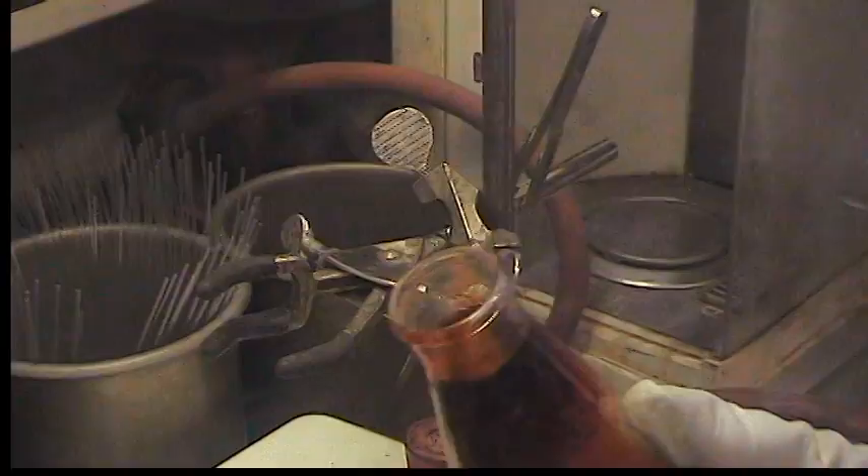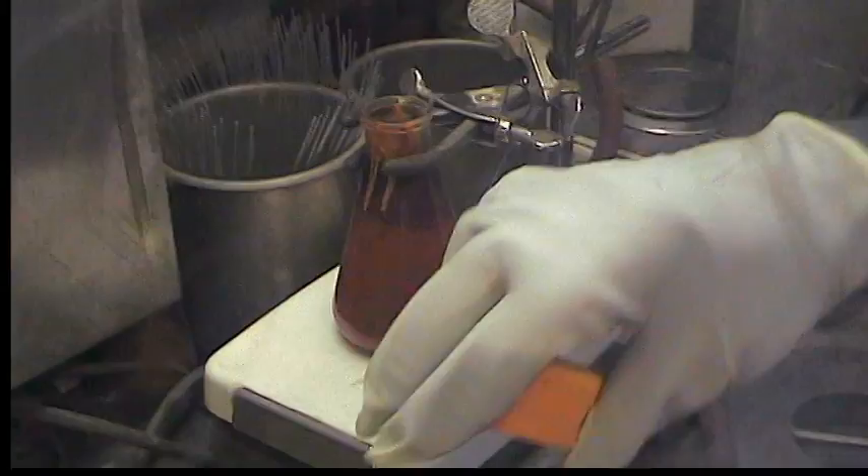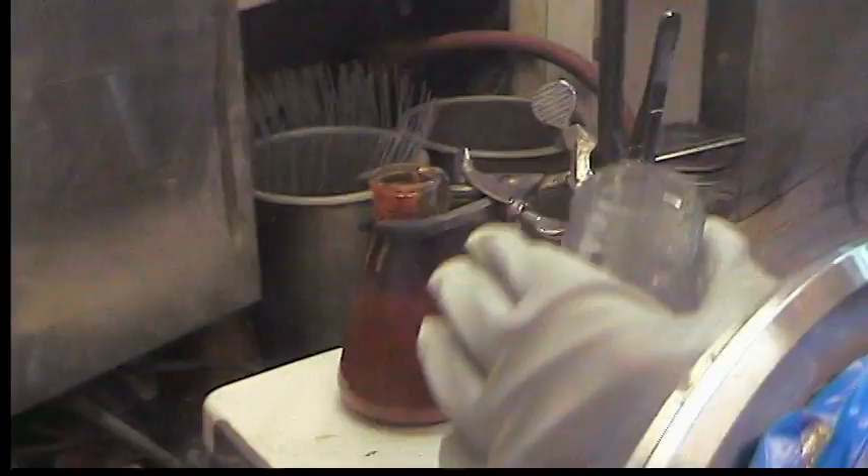Pour off a little product, and we're just going to get this stirring again. We'll add THF — I'm going to add roughly 200ml, maybe closer to 250ml.